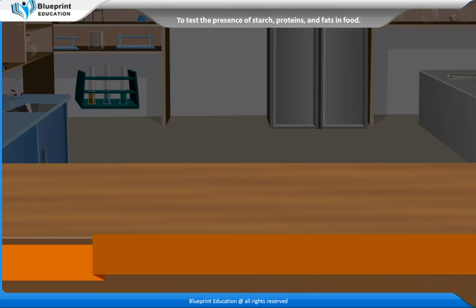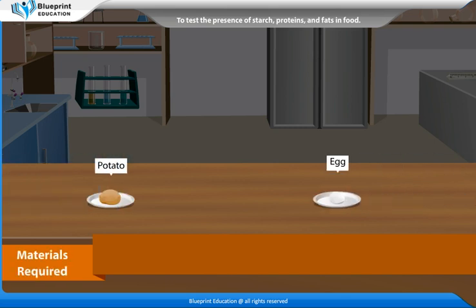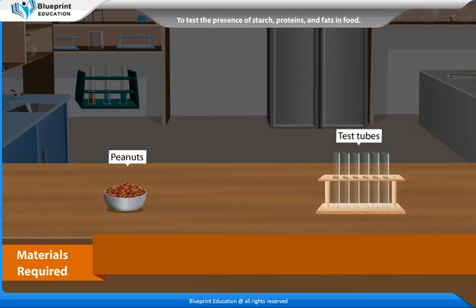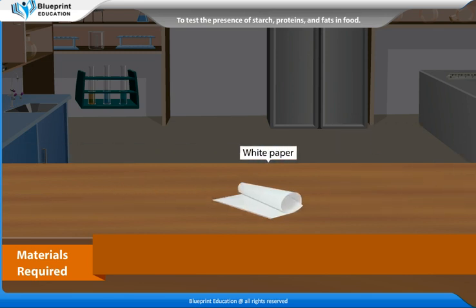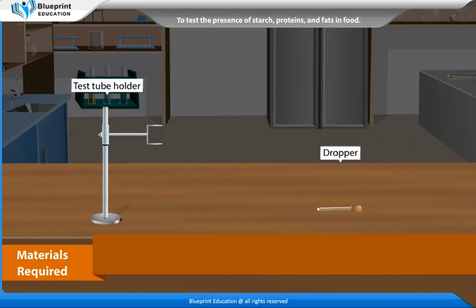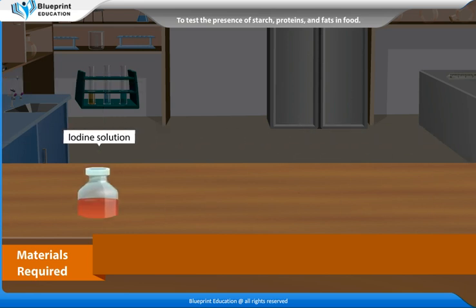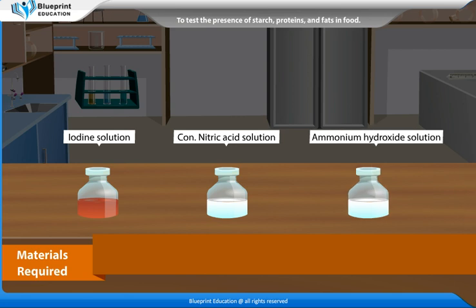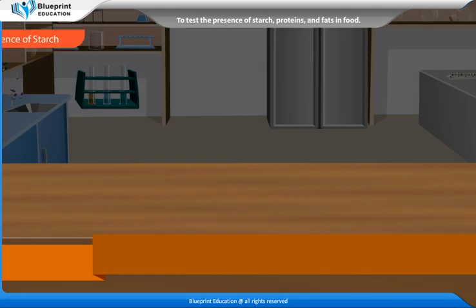The materials required are: a potato, an egg, peanuts, five to six test tubes, white paper, a Bunsen burner, a petri dish, a test tube holder, a dropper, iodine solution, concentrated nitric acid solution, and ammonium hydroxide solution.